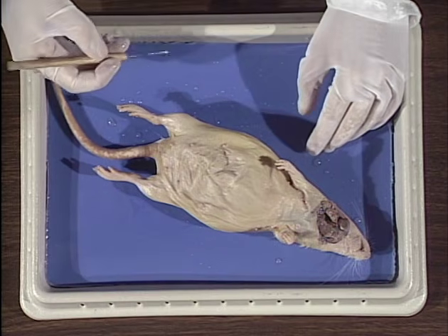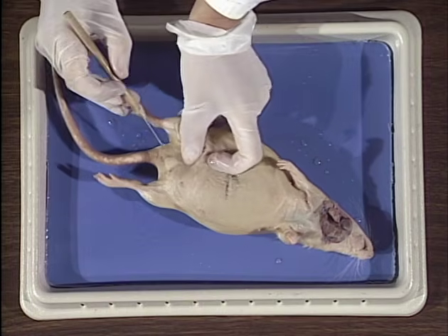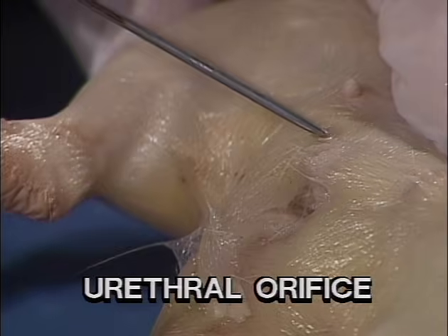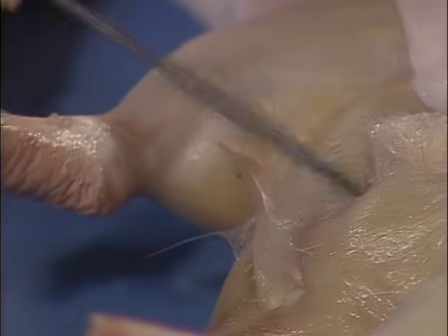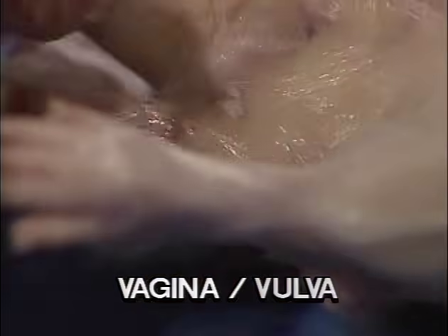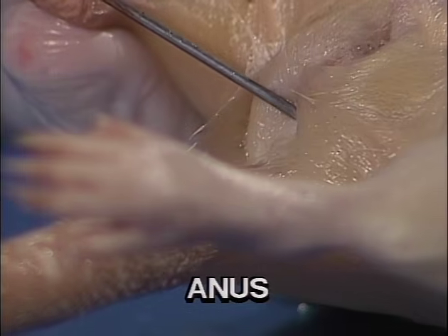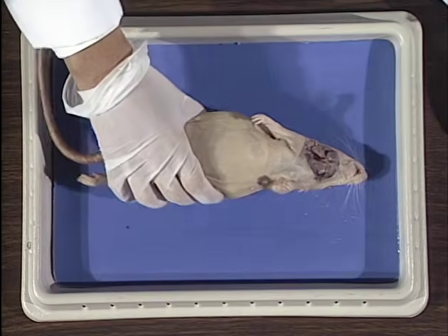Three external openings are found at the caudal end of the trunk. The cranialmost opening is the urethral orifice. It is the opening to the urinary system. The next opening is the opening to the vagina, which is known as the vulva. At the base of the tail is our third opening, which is the anus. It is the opening to the digestive tract. We are now ready to look at the male rat.